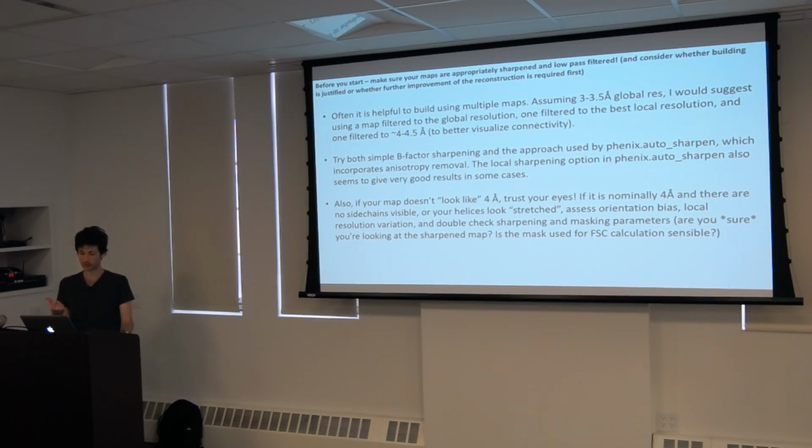The other thing to consider is your mask. Are you using a sensible mask which covers your entire molecule, or have you accidentally, for example, used a mask which was auto-generated by a threshold that isn't sensible and only covers a couple of voxels? I've definitely seen that happen, and it can lead to results that are, let's say, over-enthusiastic.